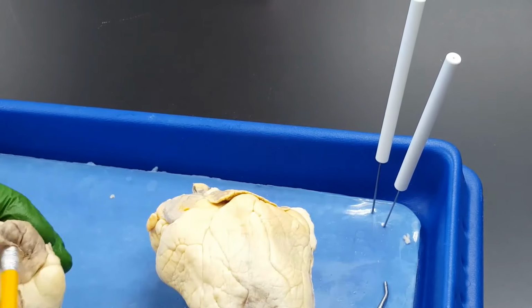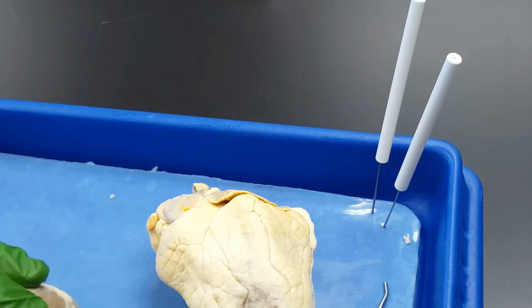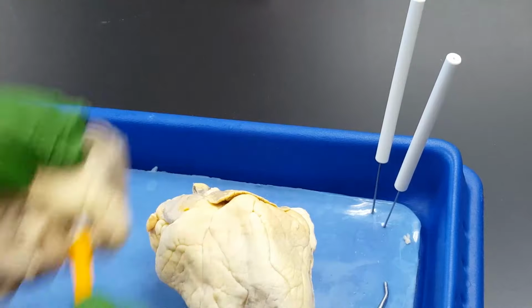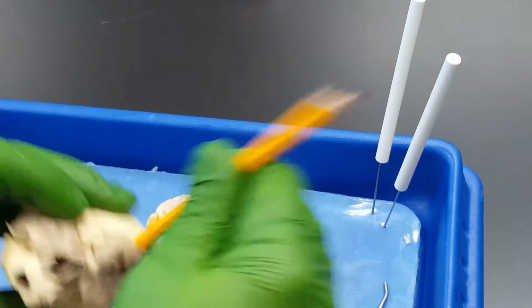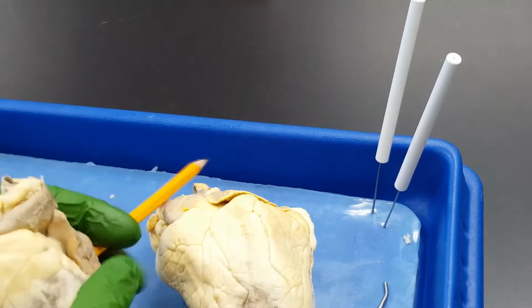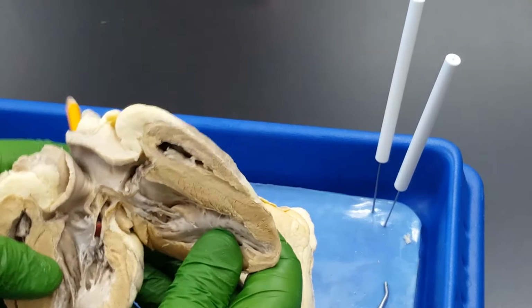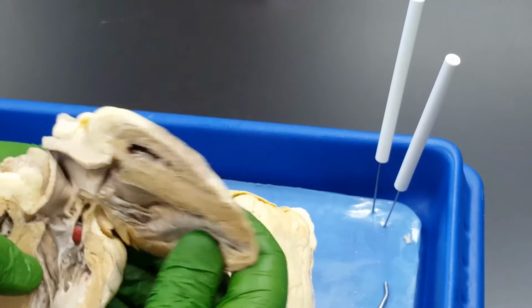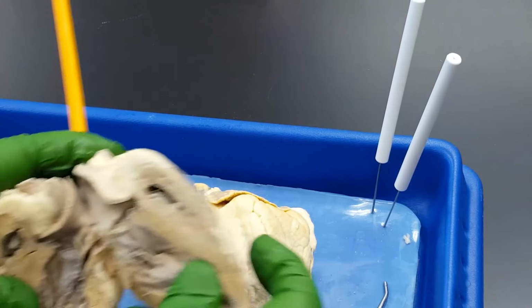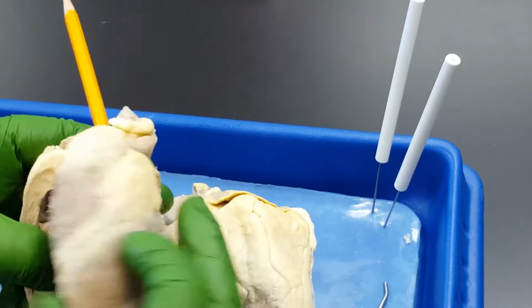Let's see if I can find something similar in this heart. Oh, look, there it is. Right here. Look at my pencil, see where it is. If I open this heart up to see the tip, see the tip of the pencil poking through right there? What great vessel would I be in here? The pulmonary veins.